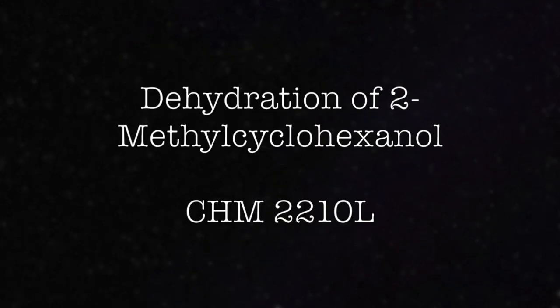In this video, we will demonstrate how to run a simple distillation in order to determine the major product of an E1 reaction involving an alkene.